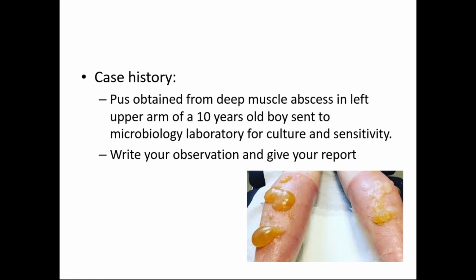Case history. Pus obtained from the muscle abscess in the left upper arm of a 10-year-old boy, sent to the microbiology lab for culture and sensitivity. Write your observation and give your report.